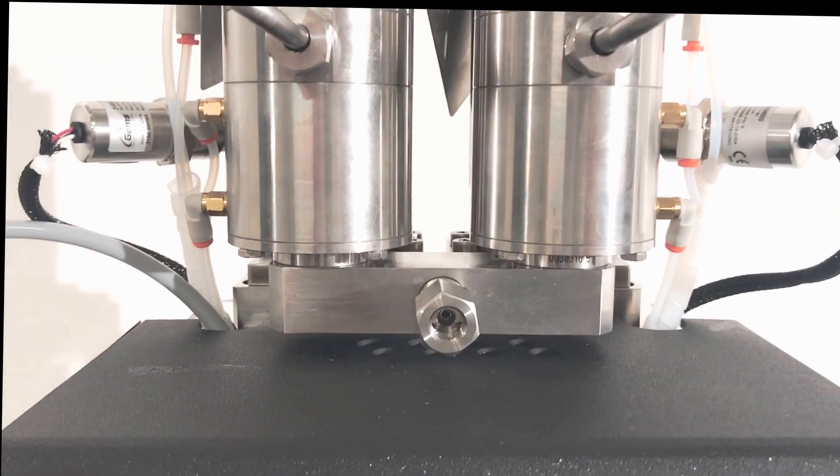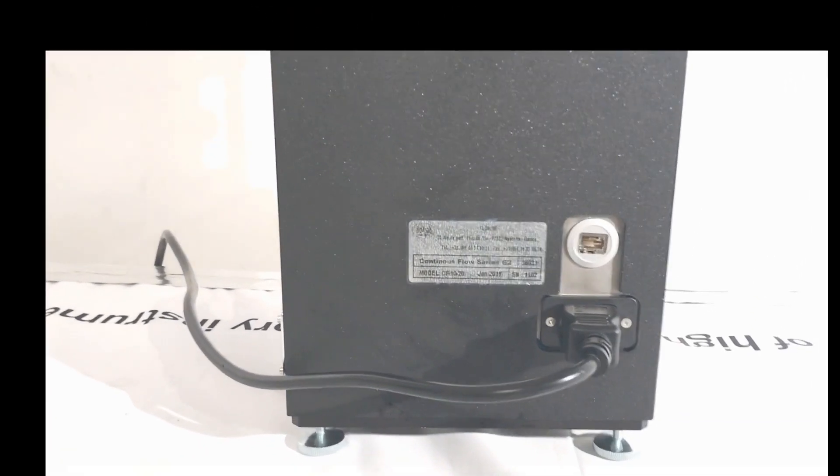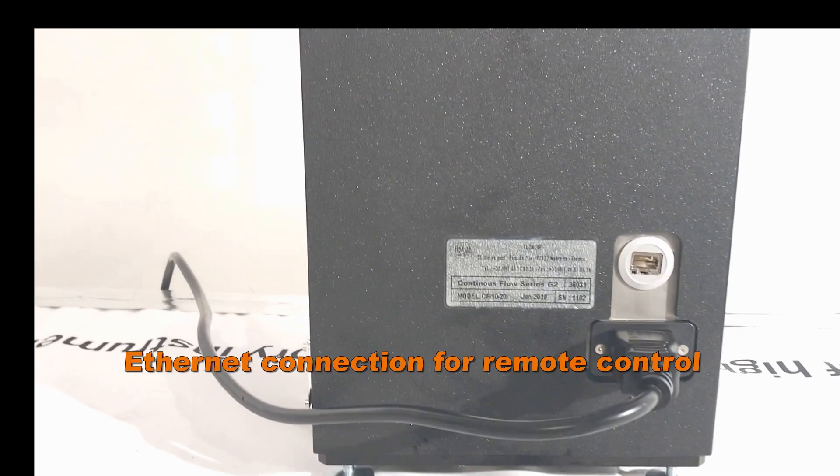Two inlet and outlet ports allow quick connections to the process lines. Running the pump is as easy as plugging in the power cord, the computer connection, and the air supply to the valves.